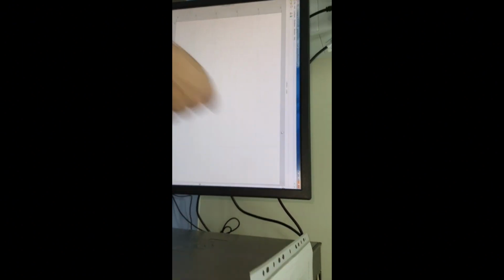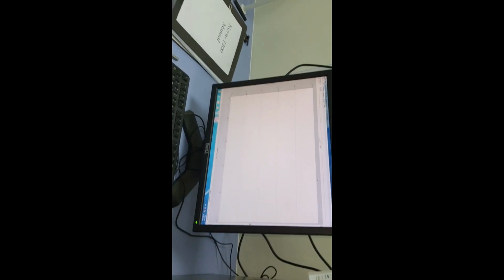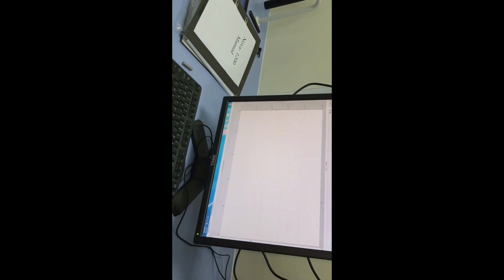We have already entered all the information, and now we are trying to change some. After making changes, this is the plot, this is the graph space where we will get the plots after the analysis has been done.